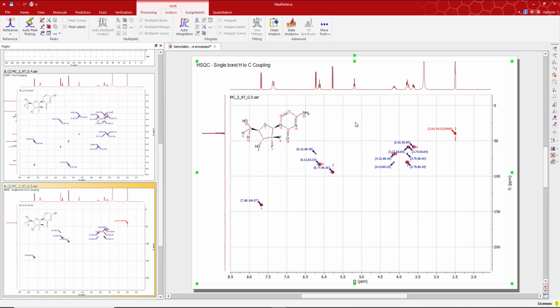The other thing you might notice is I've drawn out these 2 protons, protons 11 and 12, explicitly. The reason being that you may notice those are next to a chiral center. Those protons are diastereotopic. We would expect them to give 2 different shifts as 2 different 1H signals in the proton NMR. When we look in the HSQC, the tip-off for which protons are the diastereotopics should be that we see 2 peaks on a single carbon atom. That should be the only case of that we have in this entire molecule, because these should be the only diastereotopic protons on a single carbon.